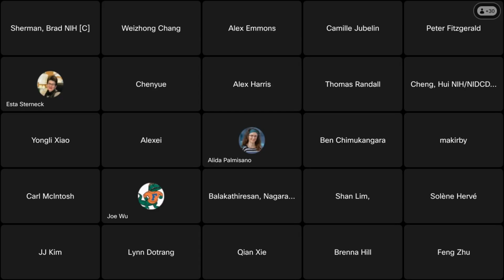And what you can do, and I showed that combine function in the list manager, is upload those two lists separately and then combine them within DAVID. But I definitely would suggest looking at it from all angles, because for certain pathways, it's important to see that certain genes are upregulated and certain genes are downregulated.